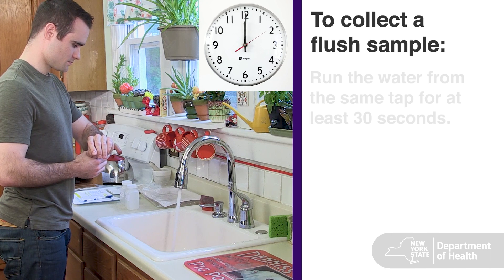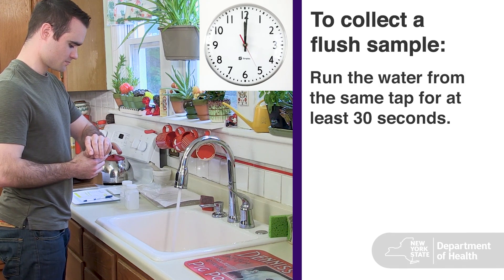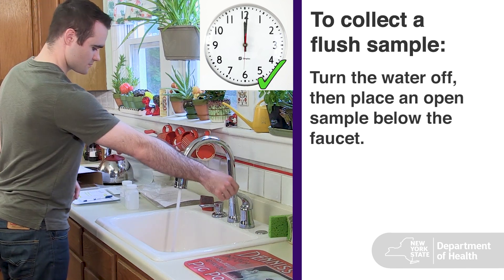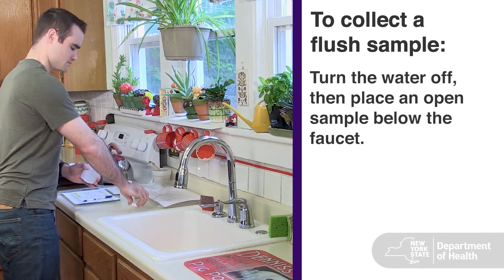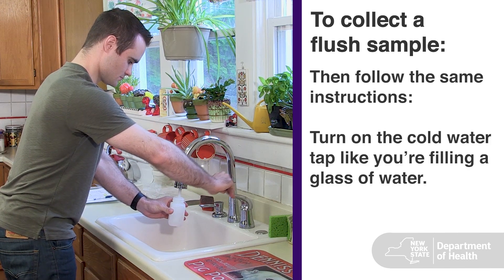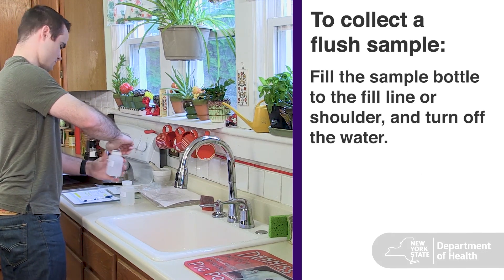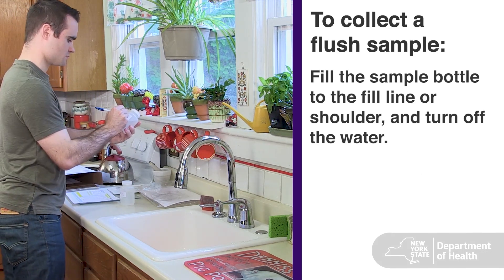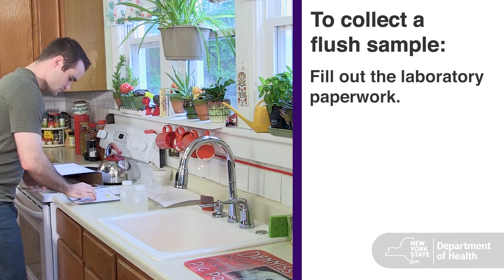Next, if you are collecting a flush sample, run the water from the same tap for at least 30 seconds. Turn the water off and place an open sample bottle below the faucet. Turn on the cold water tap as though you were filling a regular glass of water. Fill the sample bottle to the fill line or shoulder and turn off the water. Tightly cap the bottle and fill out the label.